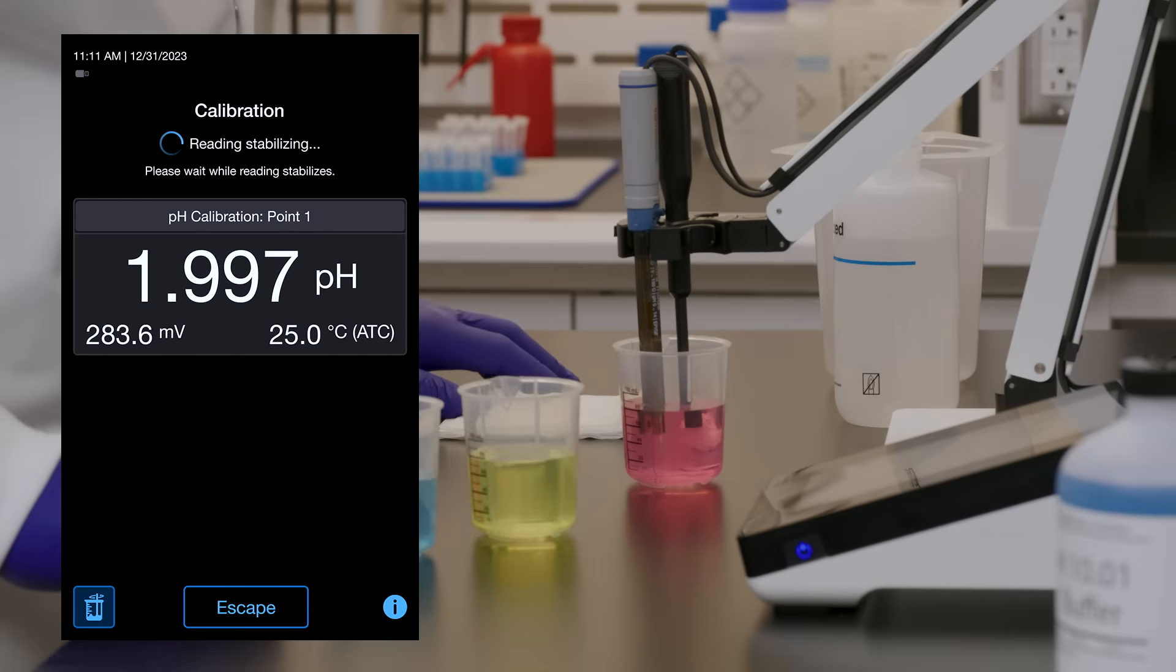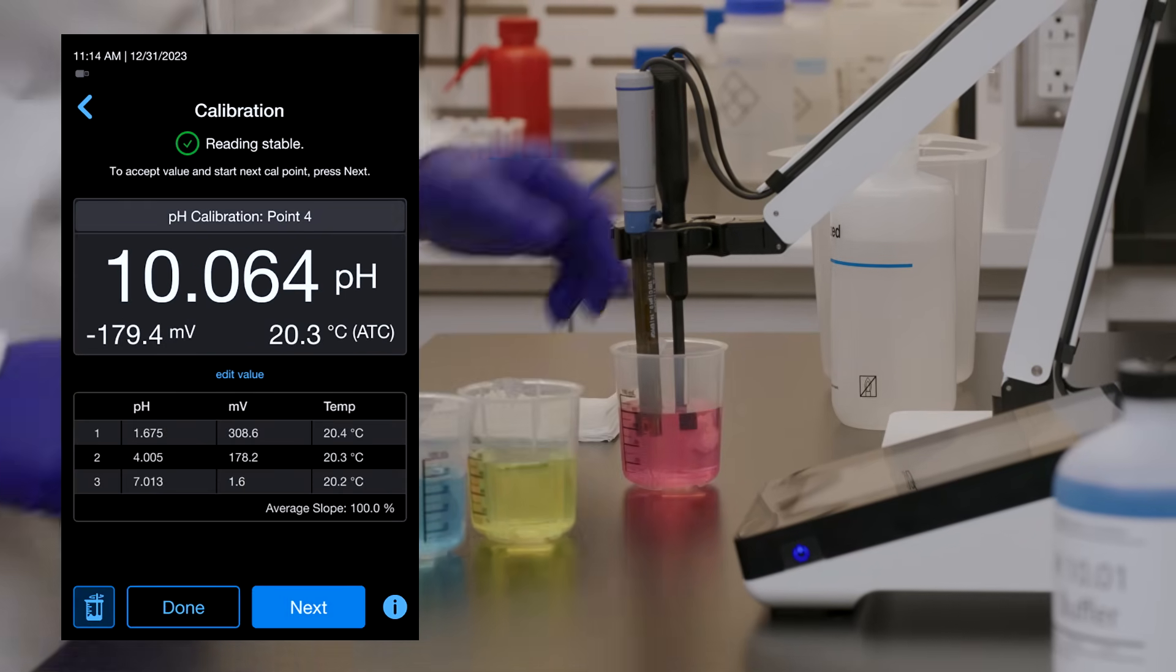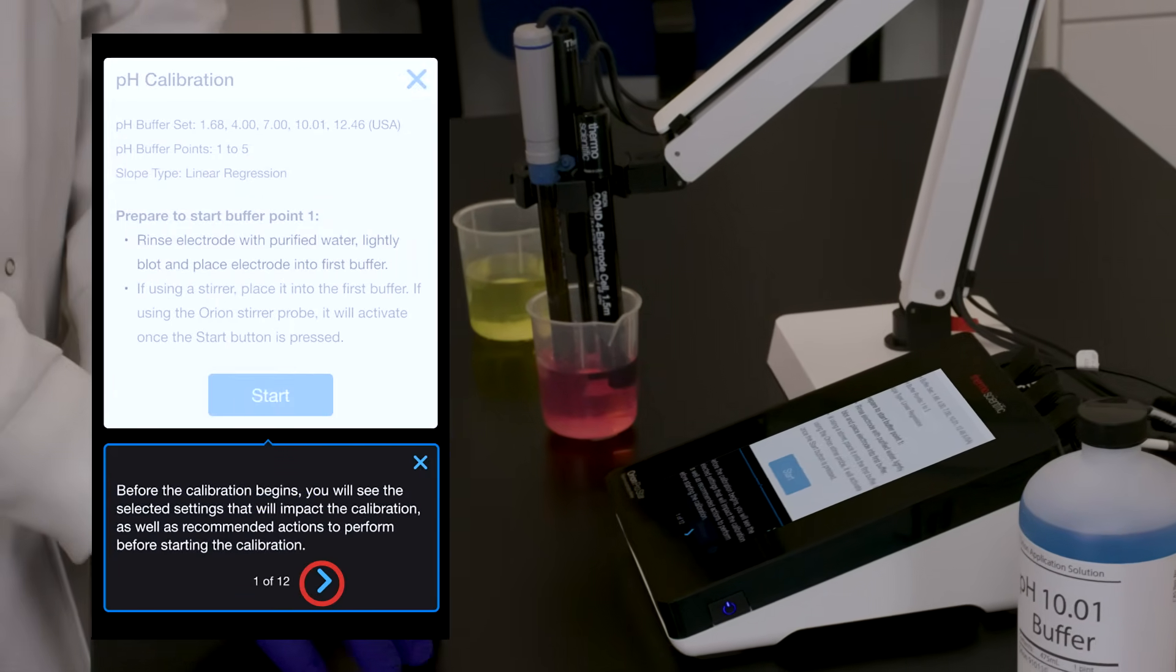On-screen, step-by-step instructions direct you through the calibration process, while tours and guides provide helpful assistance.